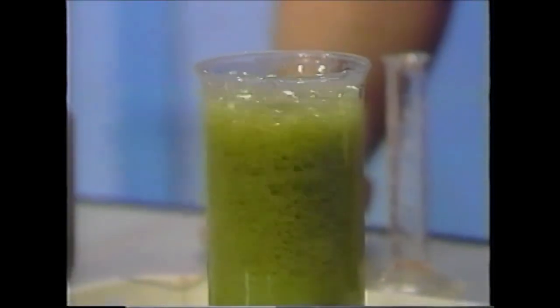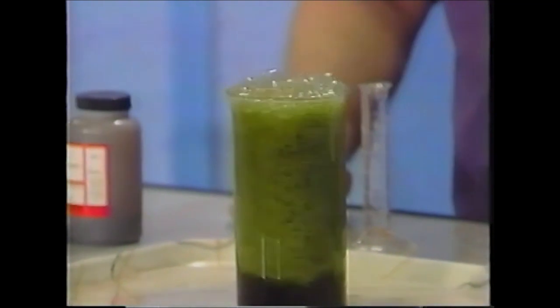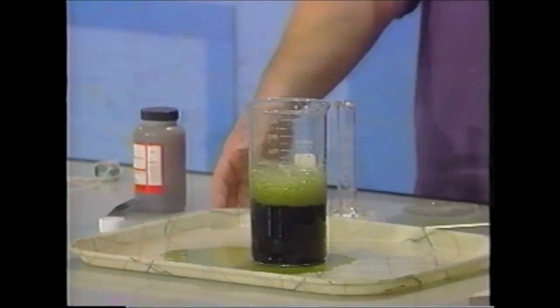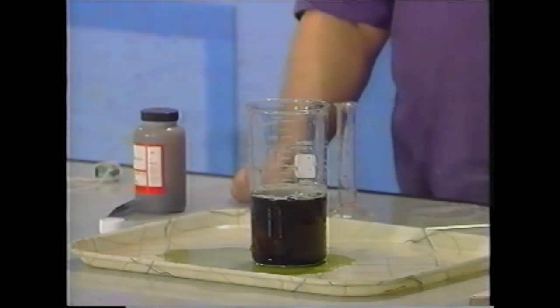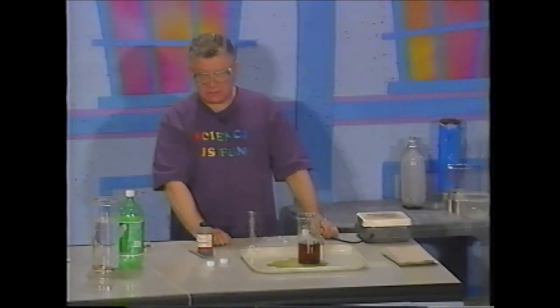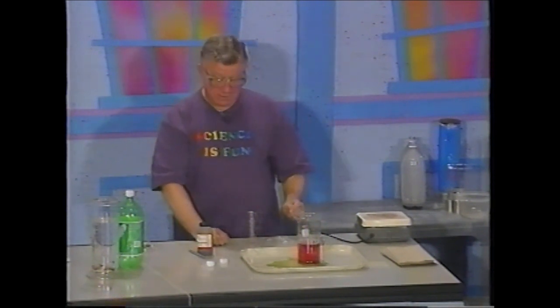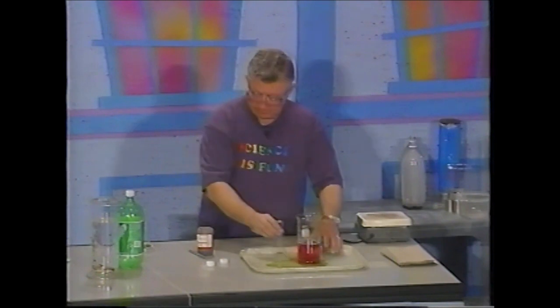You can see the bubbling. That's carbon dioxide coming from the oxidation reduction reaction. And now you know why I have a tray here. But what I want you to take a good look at is the color of the liquid, and the catalyst has been regenerated. Right?